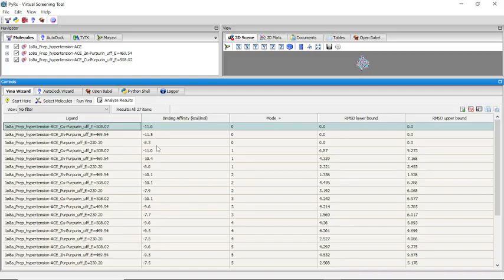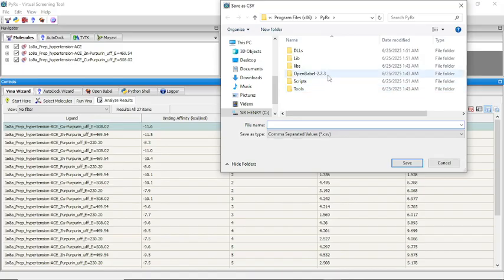But I can still see the copper purpurin repeating again. Yes, fine. Do you know why it's repeating? You are seeing under mode, 0, then 1, 2, 3. We only pick the one that gave us 0. The mode of 0, that is what we pick. So we pick the result for the mode of 0. Okay, let me take this to Excel so that you understand better.